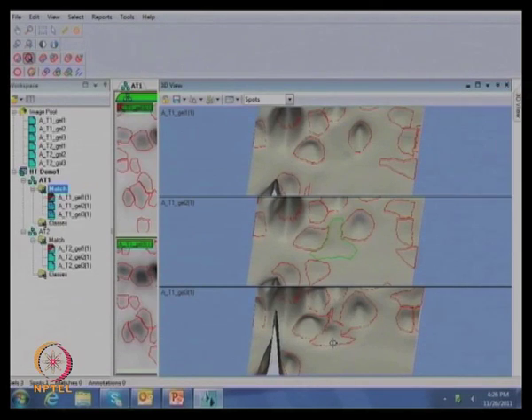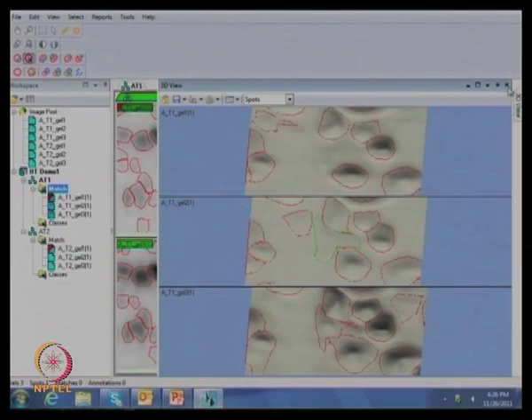Finally we can see the statistical data, whether it is there in both gels as well as treatment also, so that one can go with the statistical parameters. This will be helpful there. So no need of deleting in this case. Now let's look in detail at one of the real spots. I can zoom more so that one can see more.